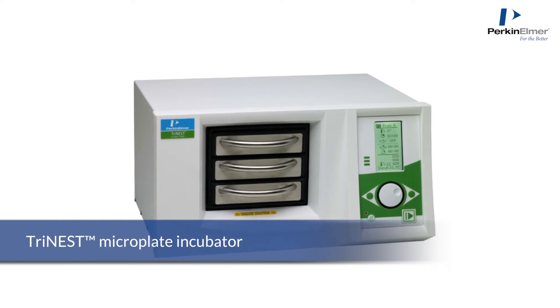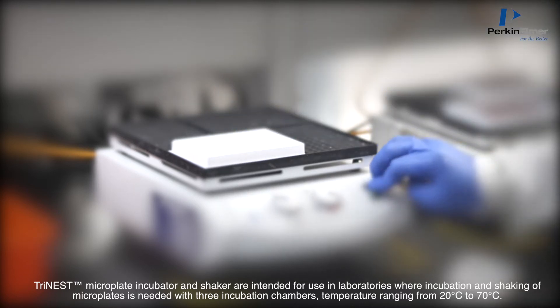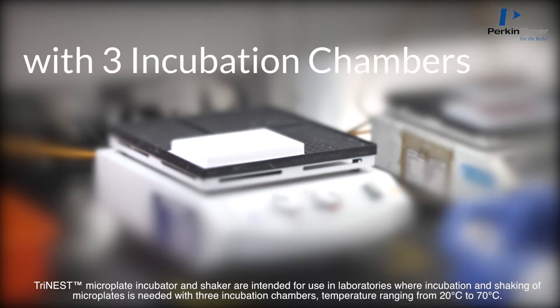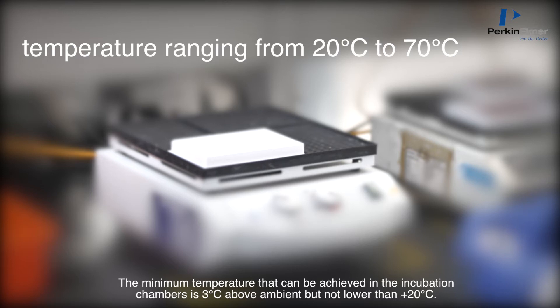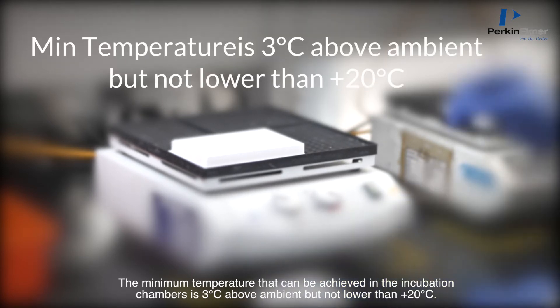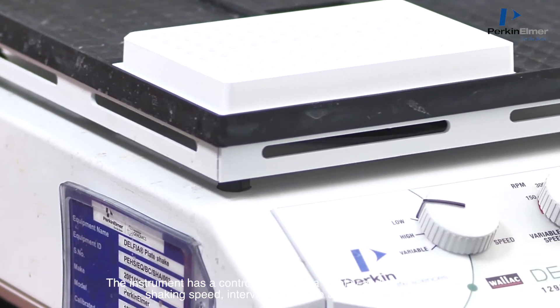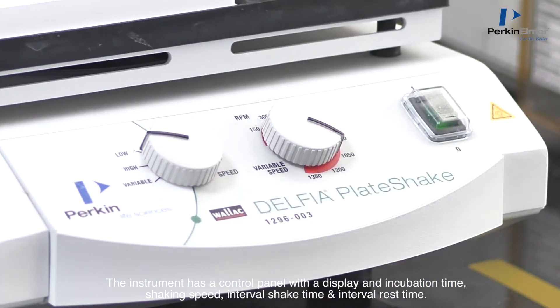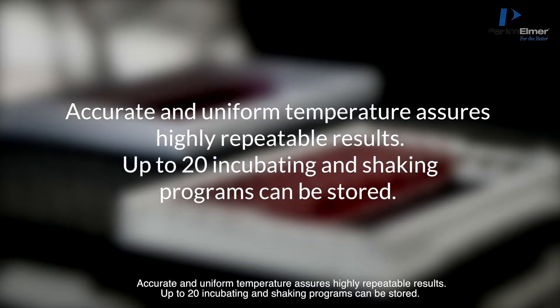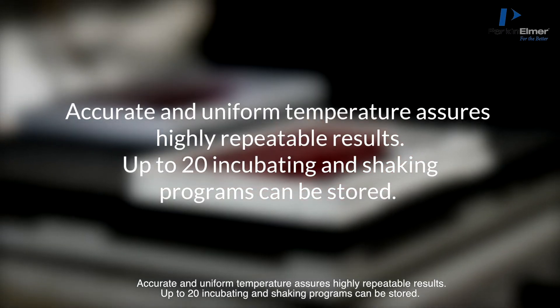The Tri-nest Microplate Incubator and Shaker is intended for use in laboratories where incubation and shaking of microplates is needed, featuring three incubation chambers and a temperature range from 20°C to 70°C. The minimum temperature achievable is 3°C above ambient but not lower than +20°C. The instrument has a control panel with a display for incubation time, shaking speed, interval shake time, and interval rest time. Accurate and uniform temperature assures highly repeatable results, and up to 20 incubating and shaking programs can be stored.